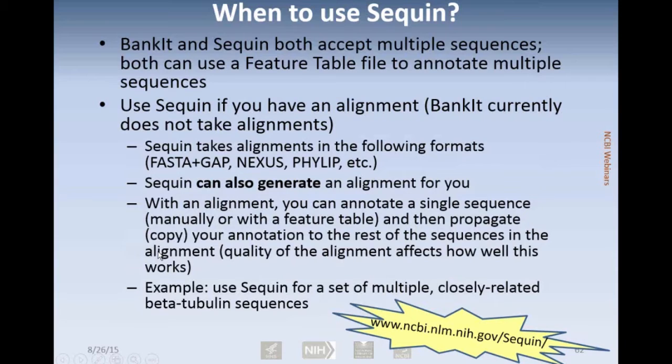When you do have an alignment, one of the features in Sequin is that you can annotate a single sequence and then copy that annotation to the rest of the sequences in your dataset. But the quality of the alignment affects how well that works. Sometimes you need to do some manual adjustment. But if you have multiple closely related sequences that are high quality, you may want to use Sequin. More information about Sequin is available from the URL listed.